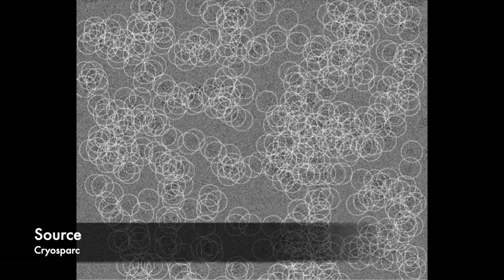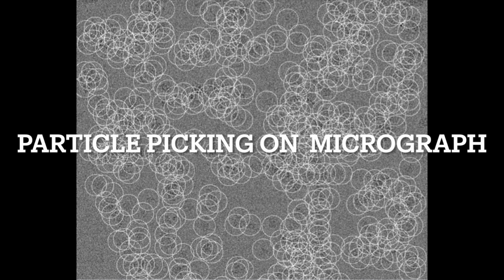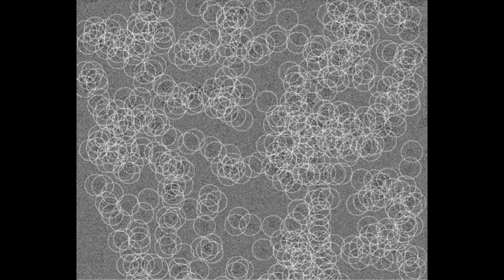Once you do all that correction, you have a good amount of data to work with. You take all of these images, which have a decent amount of defocus so that you can actually see the shapes appearing in the raw images. The first thing I do is tell the program, I'm looking for this receptor, and specifically it is 16 nanometers in length and 8 nanometers across. So I say, look for anything that fits that size and show me what you can see. From that, I was left with something like 8 million particles.